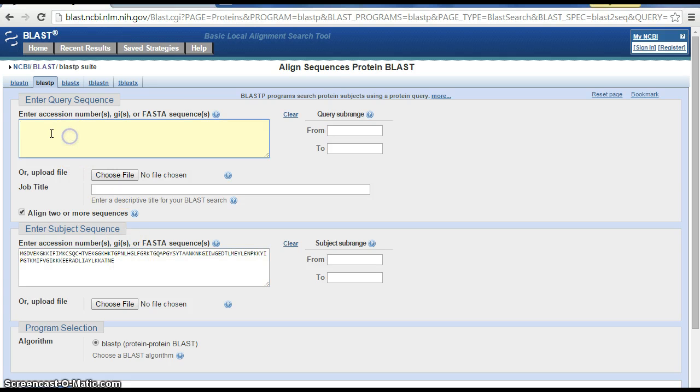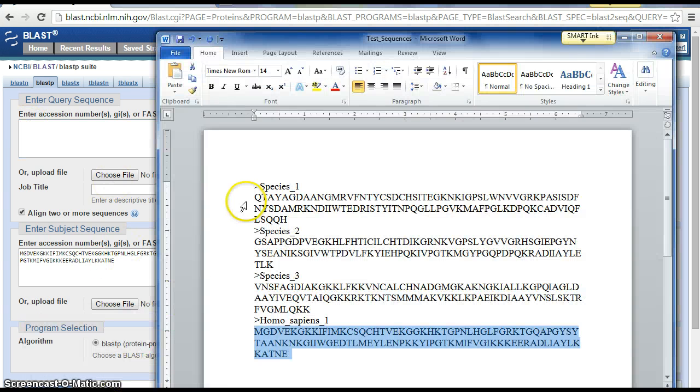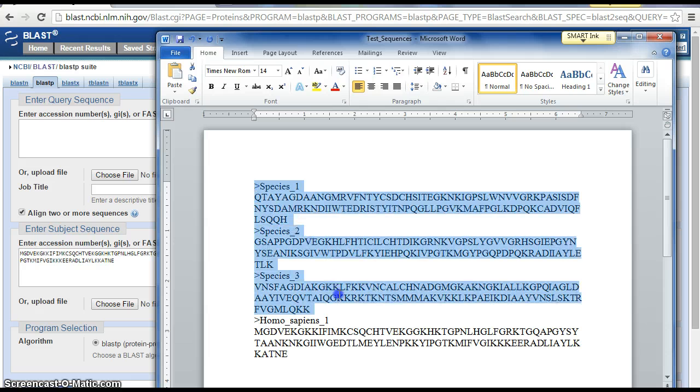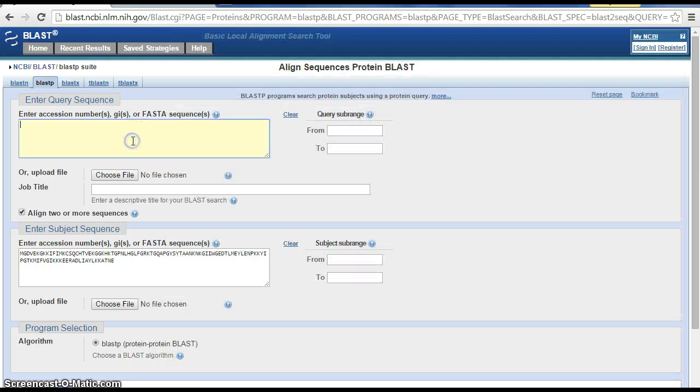Now up here is all of the sequences we want to compare to Homo sapiens. What we want to do is grab all of these species - species one, two, and three - and copy and paste everything in here.